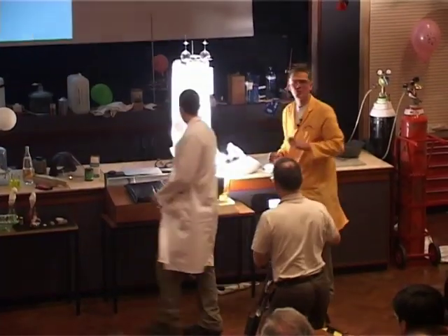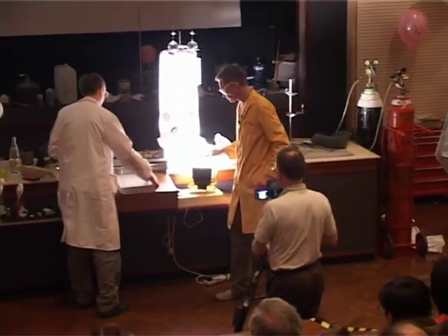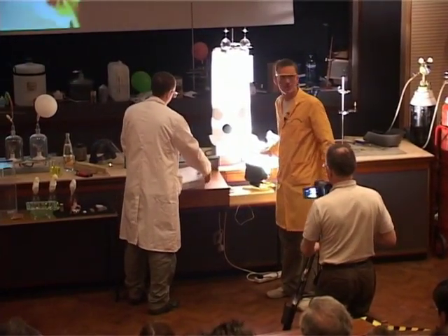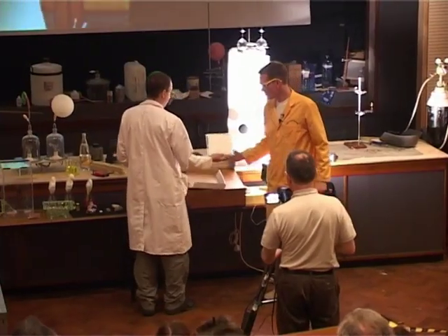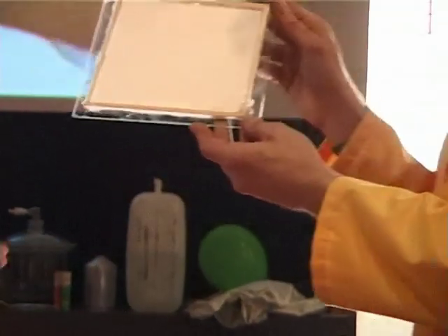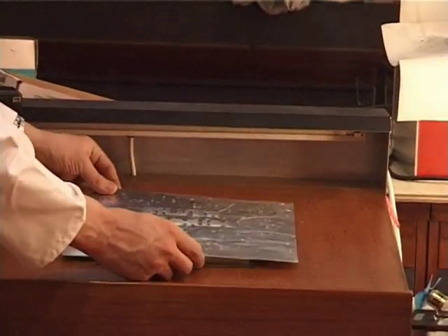Well, we can also use this light energy to bring about chemical reactions. This is, of course, the basis of photography. Now, we have here a plate. We've made this with some jelly and some silver chloride, and at the moment this is a nice white colour. Now, we're going to put a mask over this and shine some light on it.